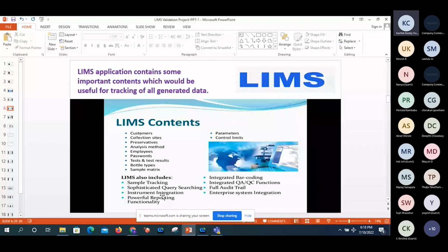After that, once we introduce packaging material, in the quality control laboratory there are many types of instruments, like balances, and file-based instruments. Balances come under port-based instruments, and KF, SWR, IR and UV come under file-based instruments.